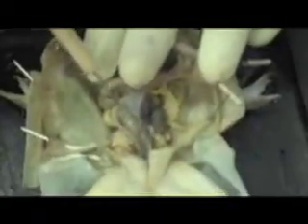Yeah, they all come out of the same hole, but they do have 3 different tubes inside, and they won't come out at the same time because of that. So that is the digestive system. Quick recap of the digestive system. I have taken it out of the cavity.